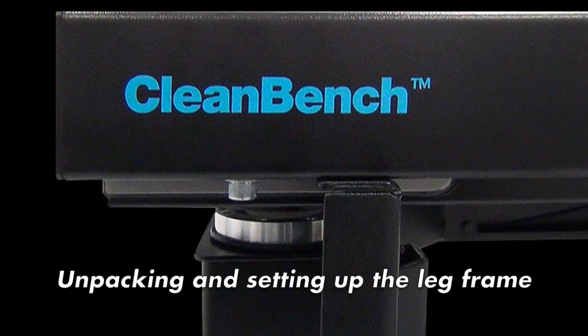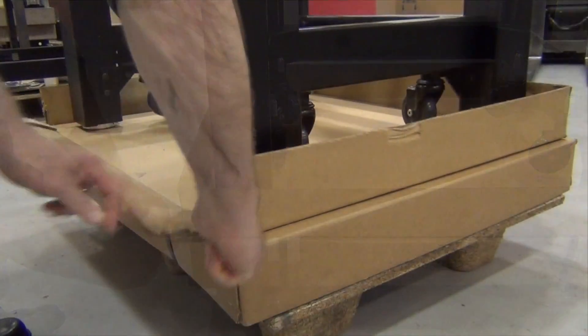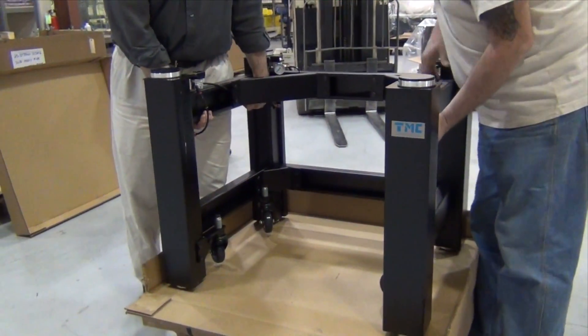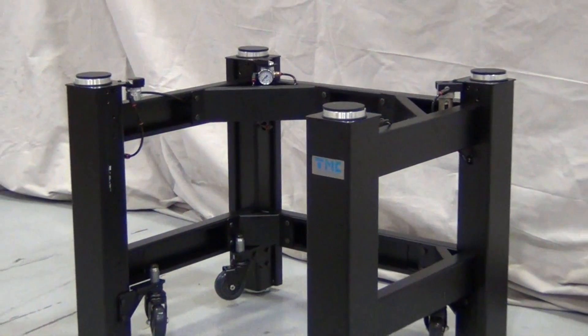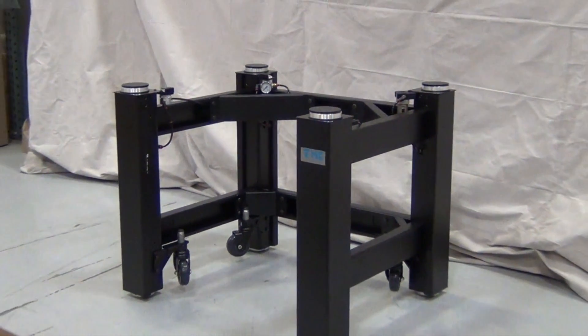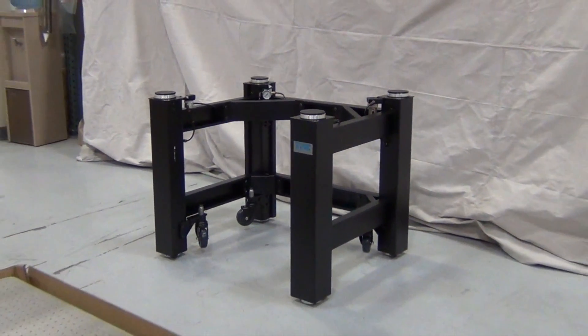For smaller frames, two people can lift it out of the box. To make it easier to lift, we are cutting back the cardboard box. Place the leg frame in the position it's going to sit in the lab. Once the top is in place, it is more difficult to move.